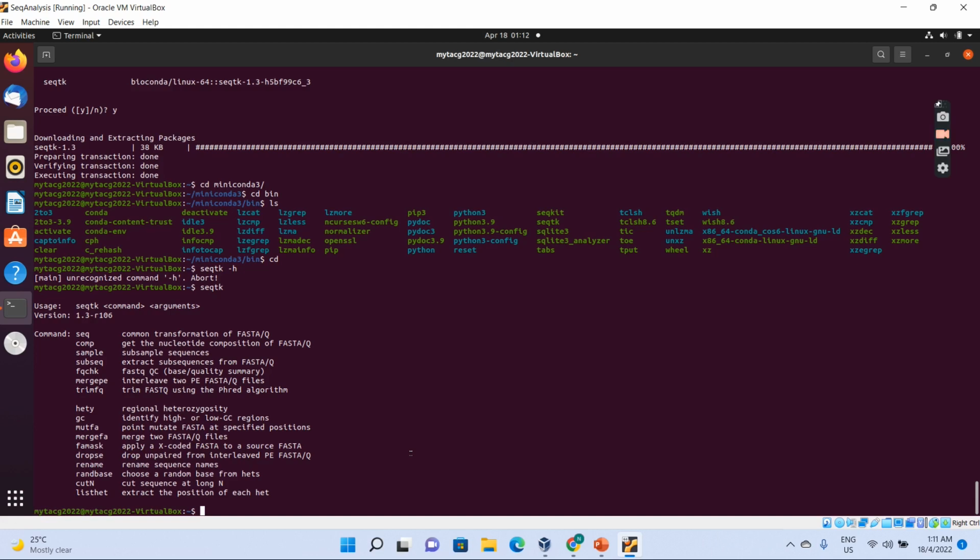So sometimes this old software written using Python 2 is unable to run in miniconda3, which is developed for Python 3. So if we are going to run this older software developed using Python version 2, we need to create a new environment specifically for software written in Python 2.7.